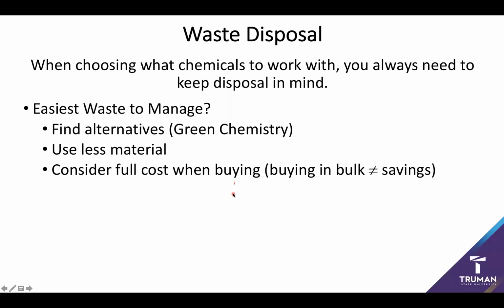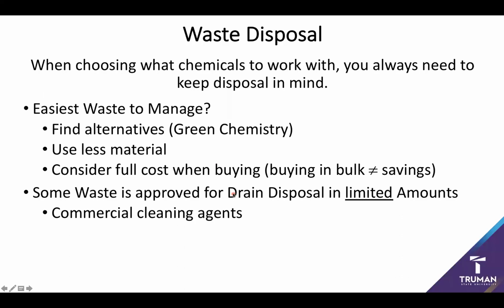One of the things worth noting is that you are actually able to drain dispose some amounts of waste in limited amounts. For example, I can dispose of bleach down the drain, but only if I have a little bit. I don't want to start disposing of 10 kilogram levels, as that might be problematic.